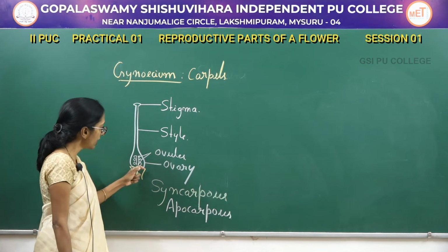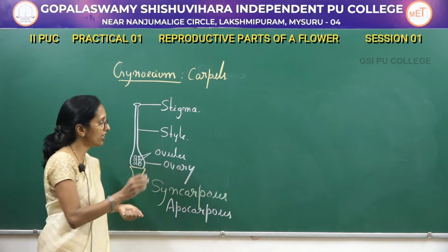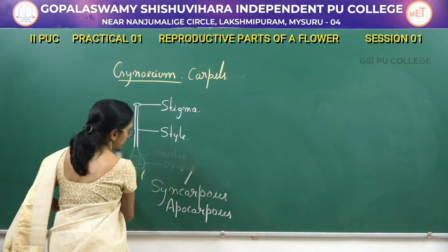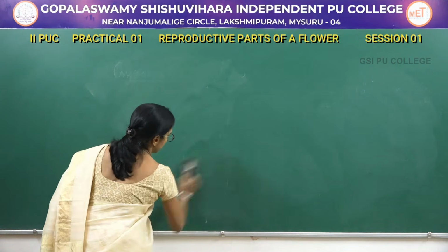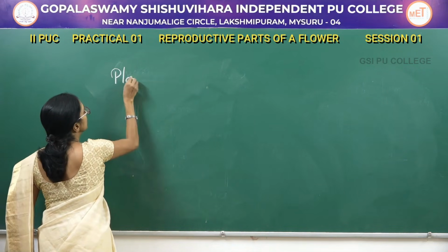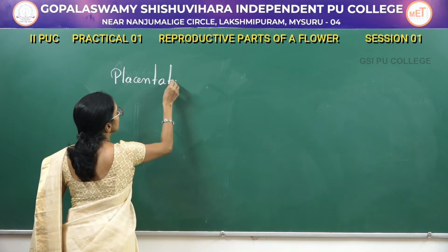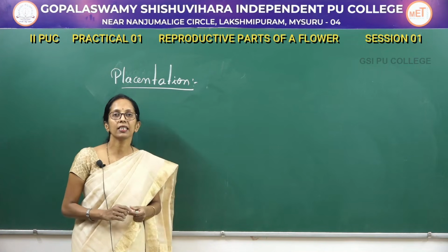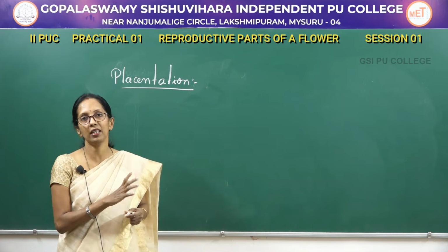Now, the arrangement of these ovules inside the ovary is called placentation.